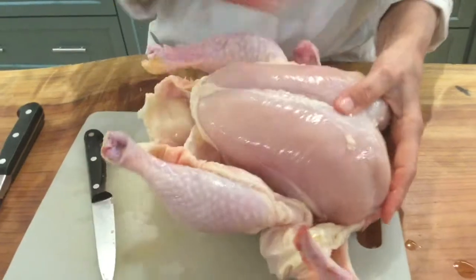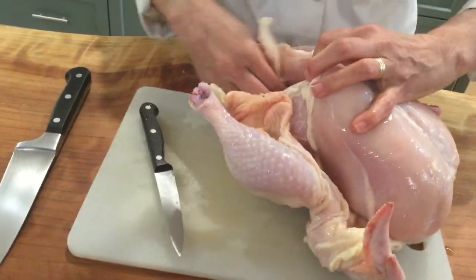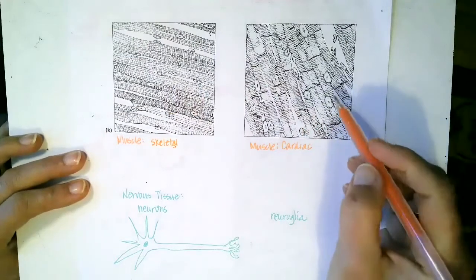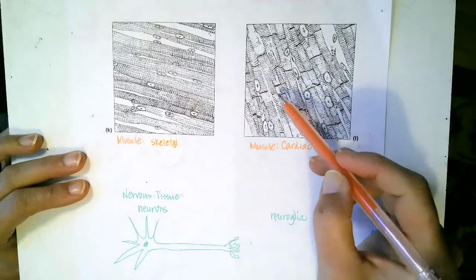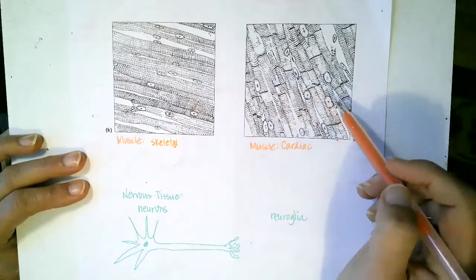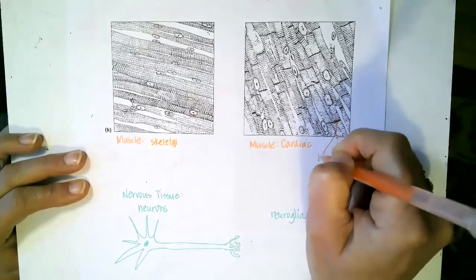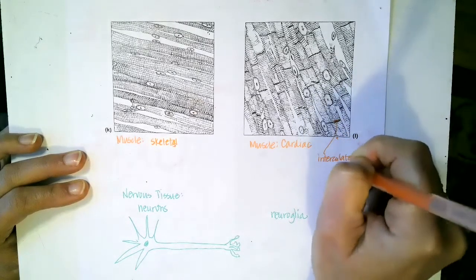A lot of times chickens will come with some giblets inside, and I was hoping that this one would have a heart in it so we could look at some cardiac muscle, but it didn't have any heart in it. Some of the similarities between cardiac muscle and skeletal muscle is that cardiac muscle is also striated, and some differences are it only has one nucleus per cell, and the fibers aren't completely parallel, they're kind of interwoven. You can also see these little dark bands where they're woven together that are called intercalated discs.